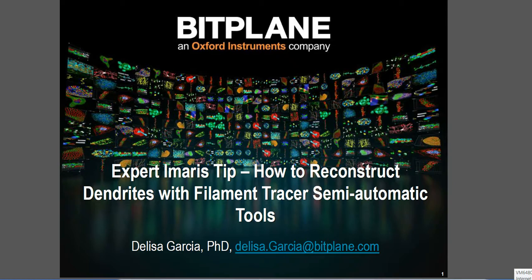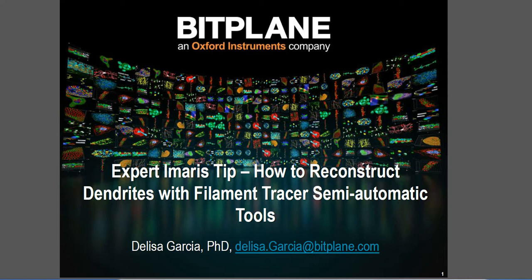Hello this is Delisa Garcia and this is a video tutorial on how to use the semi-automatic tools of filament tracer to reconstruct dendrites.